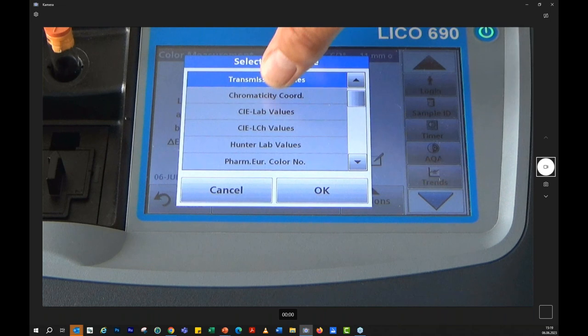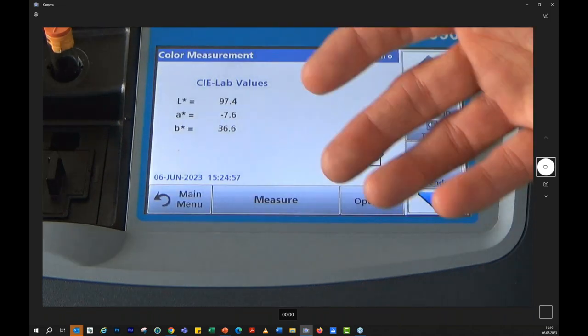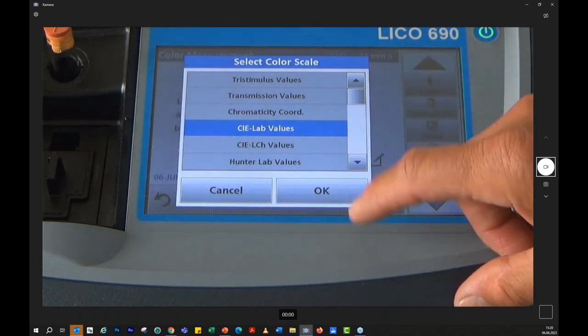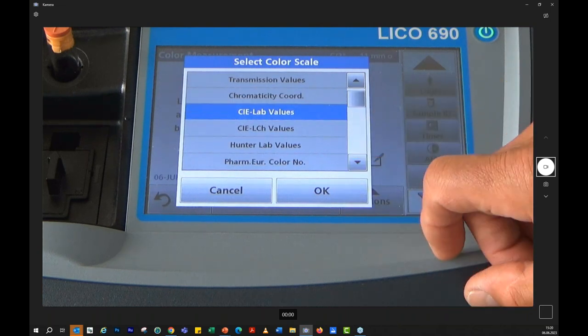So we come to these, or probably I put on this. Then we see also the mathematically based calculation of the different CIELAB scales. And we will hear from you later on much more information about how this is created and how to interpret the measurement results. So what else do we have here?